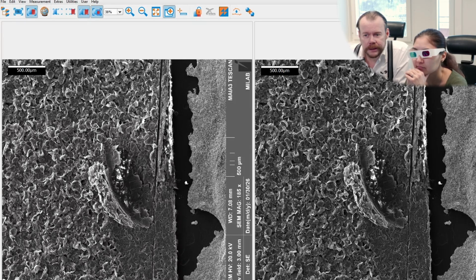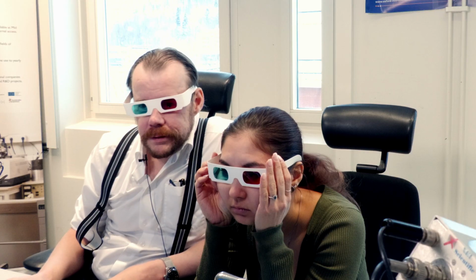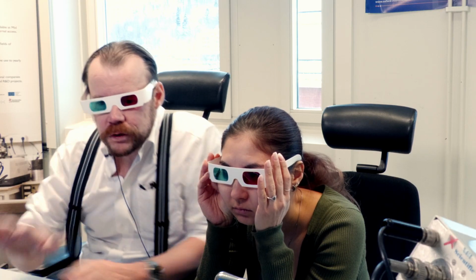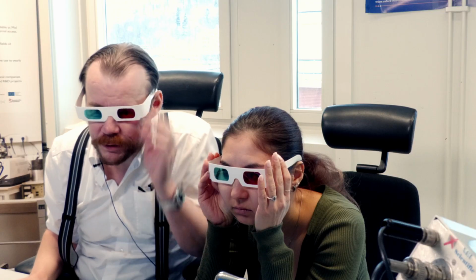How do we generate it? Here, now, it is generated, and there should be a configuration. One can choose how much to pull them apart, so to say.